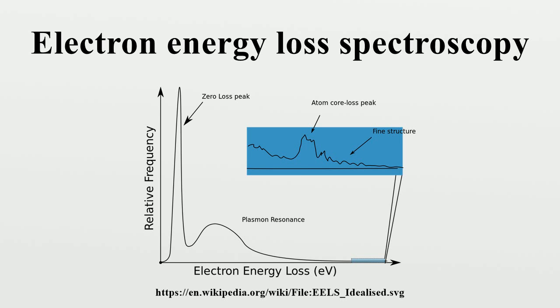Peak intensity method relies on pressure-induced change in the intensity of dipole forbidden transitions. Because this intensity is zero for zero pressure, the method is relatively sensitive and accurate. However, it requires existence of allowed and forbidden transitions of similar energies and thus is only applicable to specific systems, e.g., Xe bubbles in aluminum.